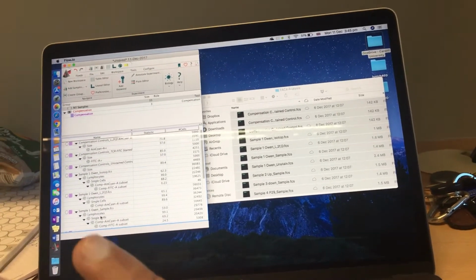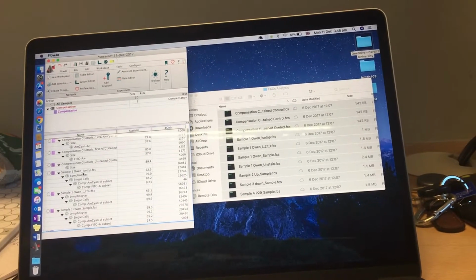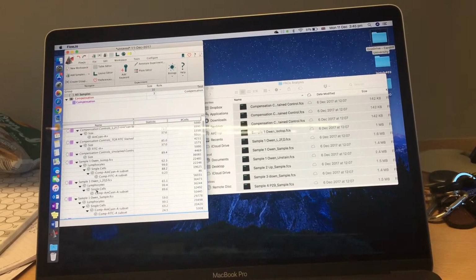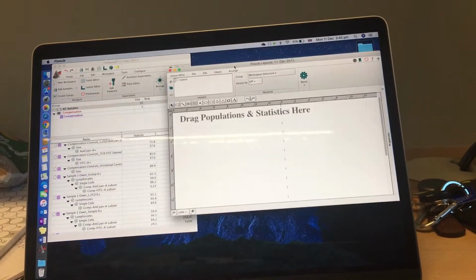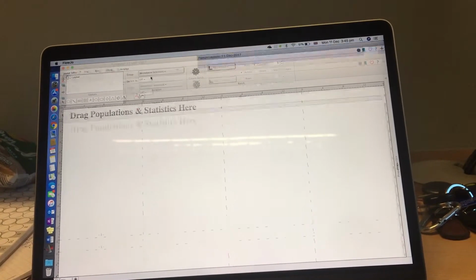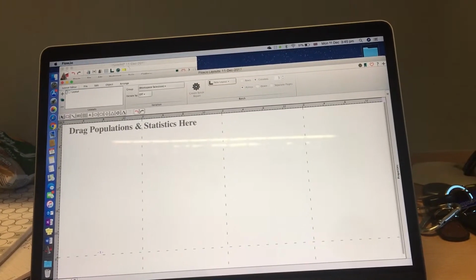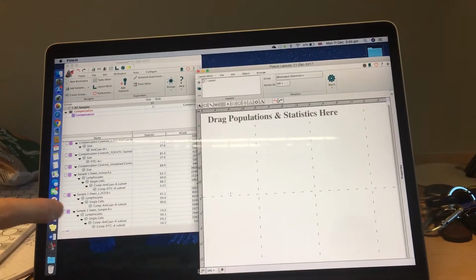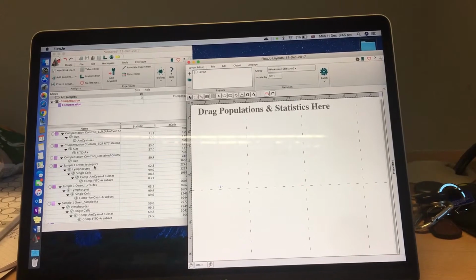Okay, that's easy. I know how to analyze it on the layout. Why don't you check what the isotype is relative to the sample? The layout editor. So drag AmCyan from the isotype, right?